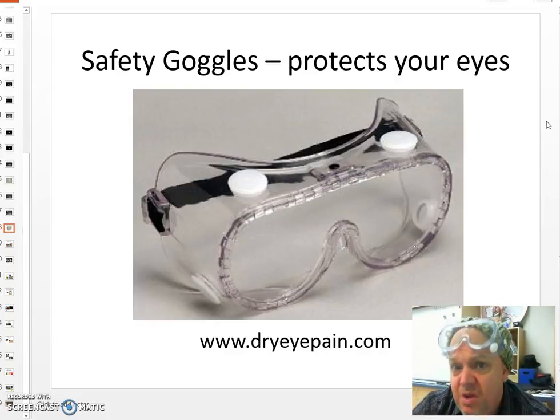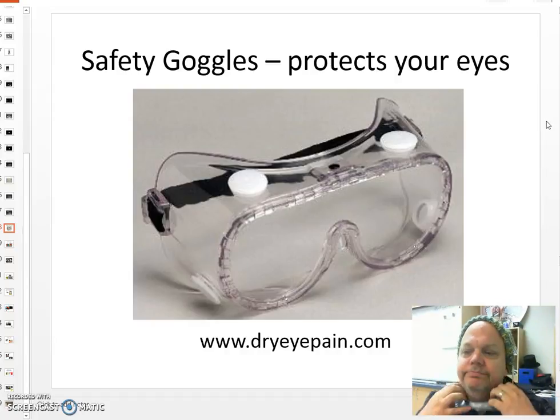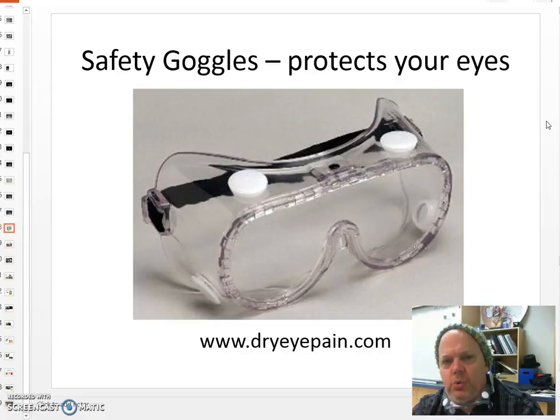Now, there is another method that people have used to wear goggles, and that is around the throat. Professionals like General Erwin Rommel, aka the Desert Fox, has done it this way, but the Desert Fox wasn't in a lab, and he was cooler than you are, so you don't get to do that in the lab.